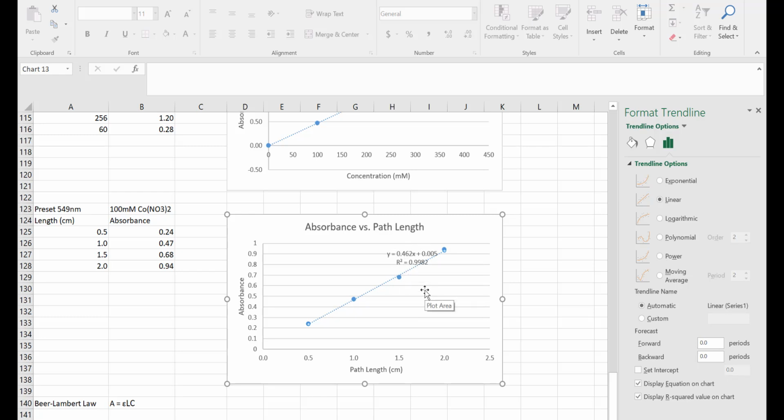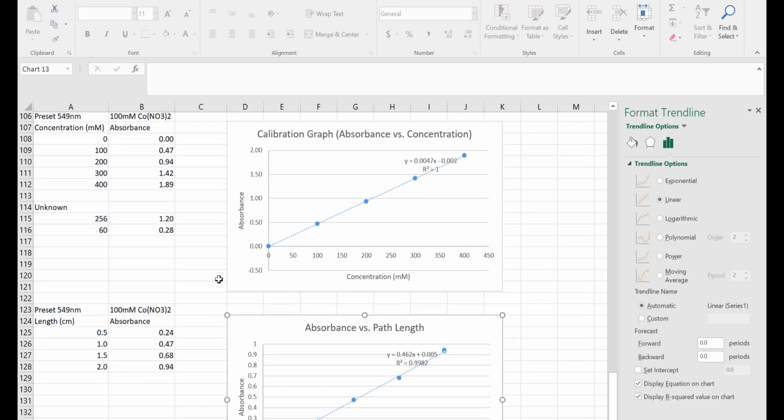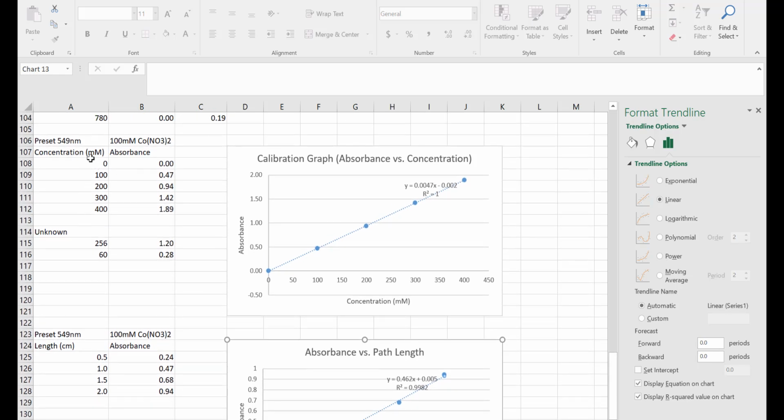All right. So based on this lab here, we can actually have support for what's referred to as Beer's law or the Beer-Lambert law. And what it says here is at really low concentrations, your absorbance in the aqueous solution is proportional. This epsilon symbol here is called the molar absorptivity. That one there is going to be a constant depending on the chemical that we're looking at. But you see that it's proportional. Absorbance was linear when I changed the path length, keeping concentration the same, or keeping the path length the same here, as I change concentration, the absorbance would also differ, linear.